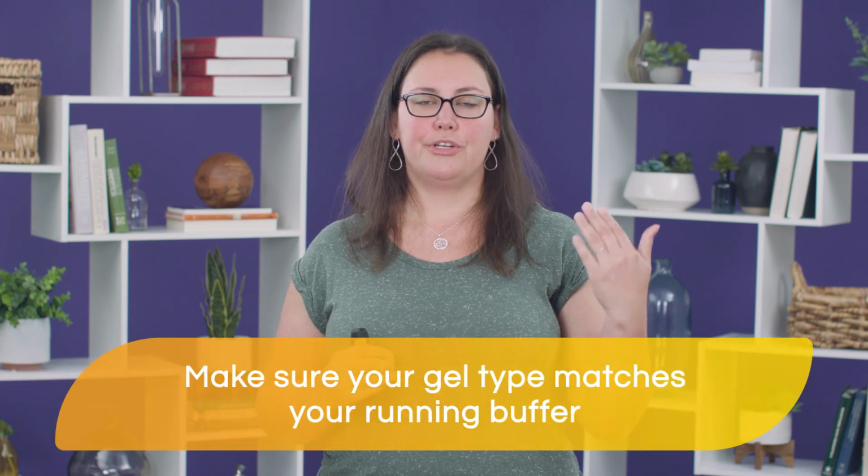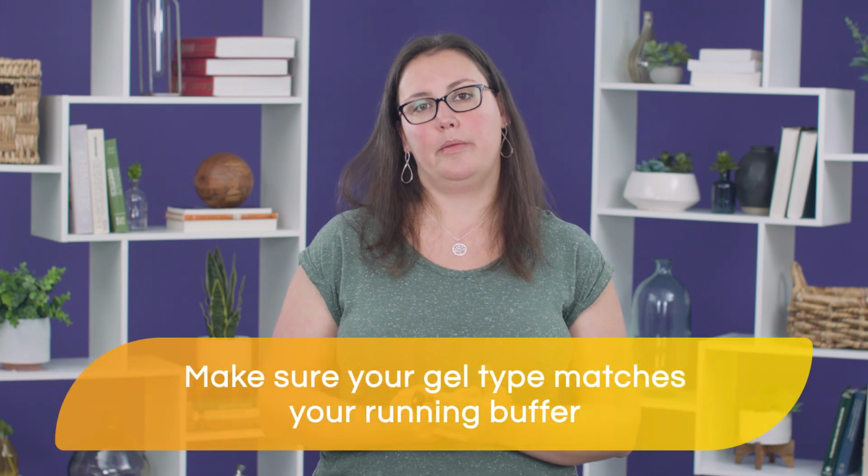Knowing all these tricks that we just talked about is great, and it's really gonna help you get great quality data. But there's still more that we have to think about for our SDS page. In the science section, Darren has explained to you how important it is to choose the percentage and the type of your gel. He has also covered how choosing your running buffer can really influence the outcome of your SDS page. Now, it is equally important to make sure your gel type matches your running buffer.